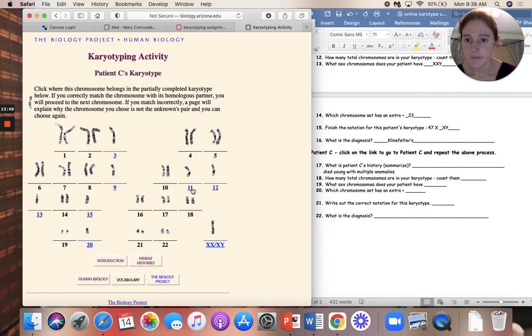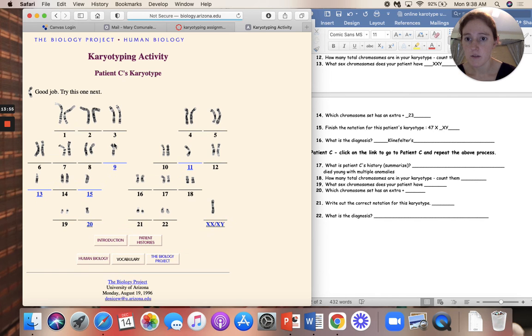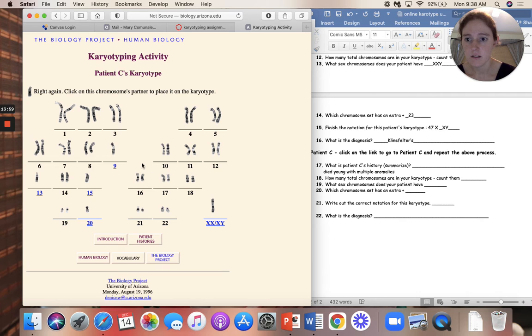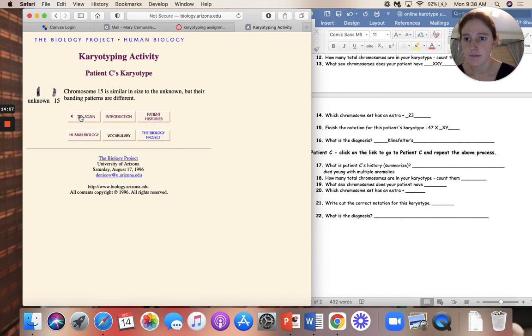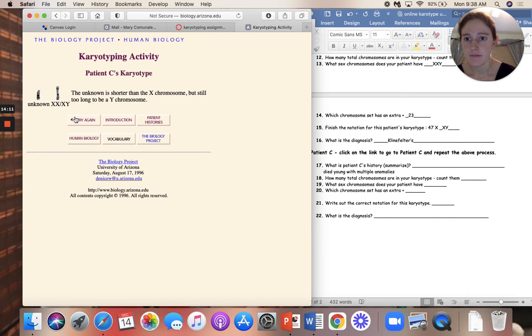I'll go with 12. This chromosome, maybe number 3. 11. I feel like I'm going to get this one wrong. Put it over here.